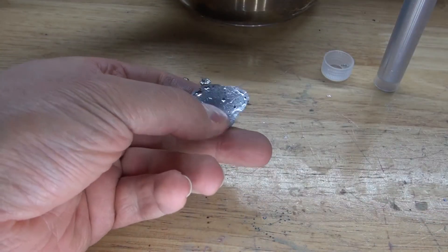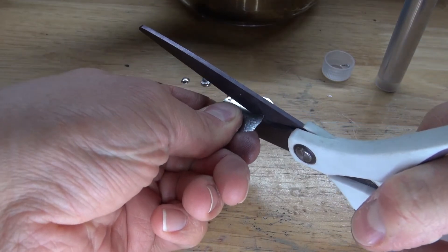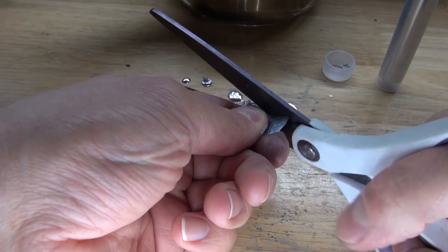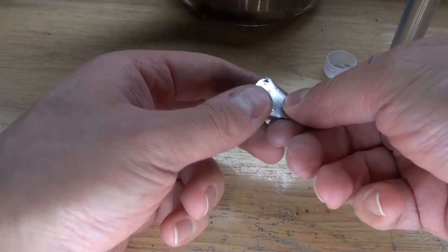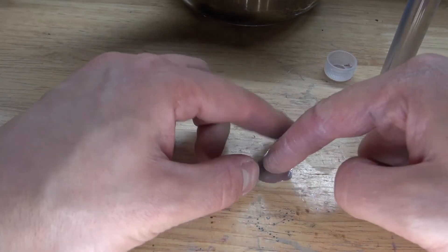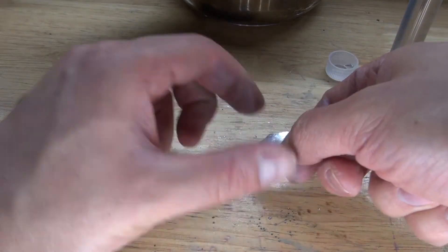Yet it can melt at a low temperature of 60 degrees Celsius. I want to see what happens if I try cutting it. Oh, it cuts very easily. Interesting. What about hardness? Can I scratch it with my nail like indium? No, it does not. So it has hardness to it.